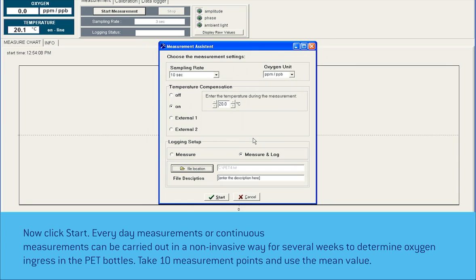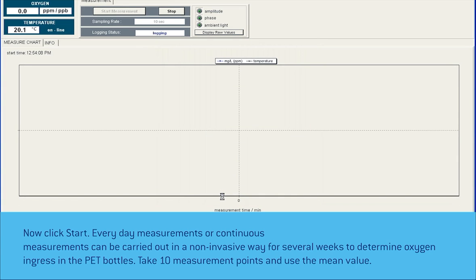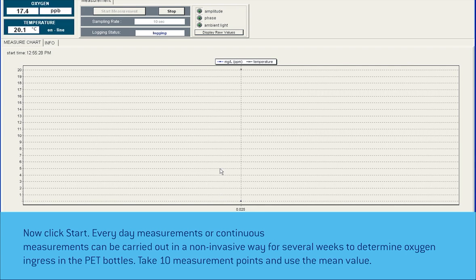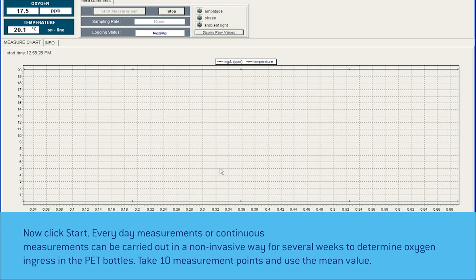Then click Measure and Log and choose a file location and file name. Now click Start. Everyday or continuous measurements can be carried out in a non-invasive way for several weeks to determine oxygen ingress in PET bottles. Take 10 measurement points and use the mean value.